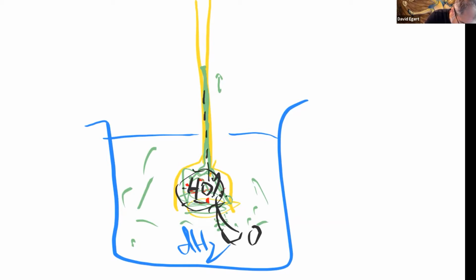If, let's say the membrane did let sucrose cross the membrane, what would I see after a little while? The level of the water in the beaker go up. No. How would that? The water wouldn't come from any place, really. It would even out. It wouldn't move, right?